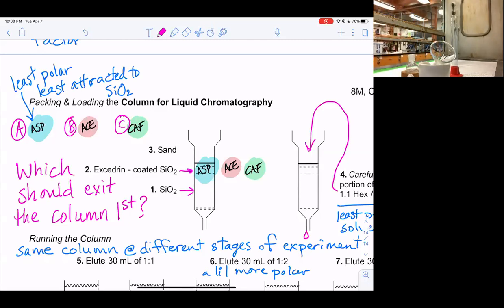So I'm going now to grab some silica gel, and essentially it is a very polar molecule that will bind to all of the components in that mixture, and the rotovap will then pull off all the ethyl acetate, leaving dry silica gel and the components that are bound to it. Hopefully that makes sense to everyone. It will in a second, whenever I try and deftly put this in. Not really. There we go.